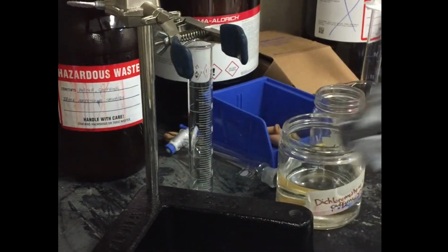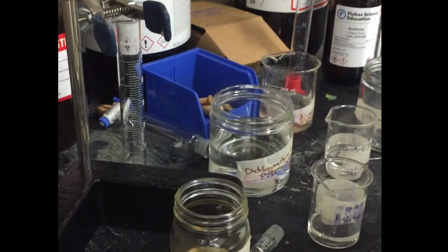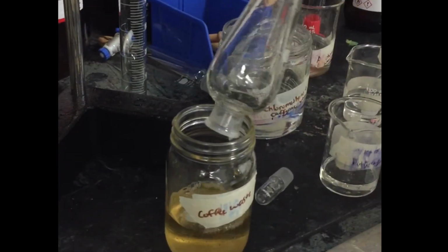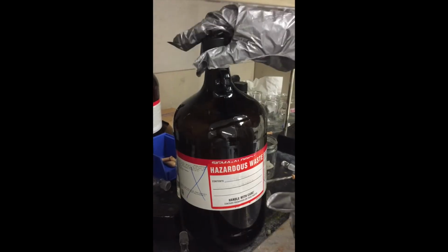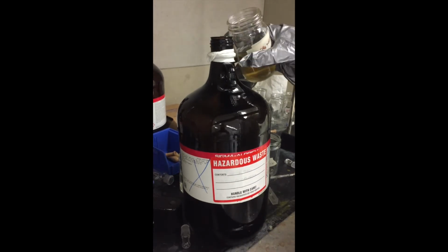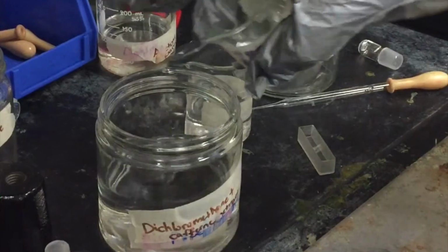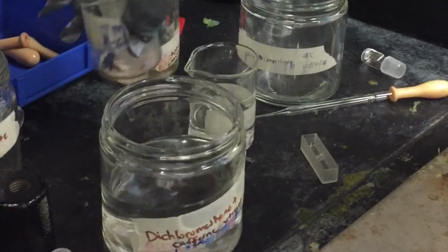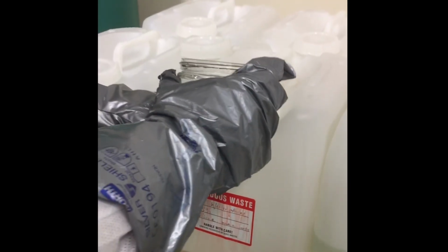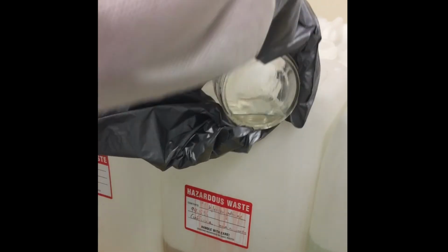Chemical waste is then disposed of into properly labeled containers. The aqueous phase containing coffee waste and trace amounts of DCM is poured into a secondary transfer container after each separation is completed. When all trials have been completed, this container is emptied into a larger amber container with the proper hazardous waste tag. Organic DCM waste is transferred to a separate secondary container and then to a larger waste container when the secondary container has filled. Acetone waste used to clean lab equipment is deposited into its own labeled container.